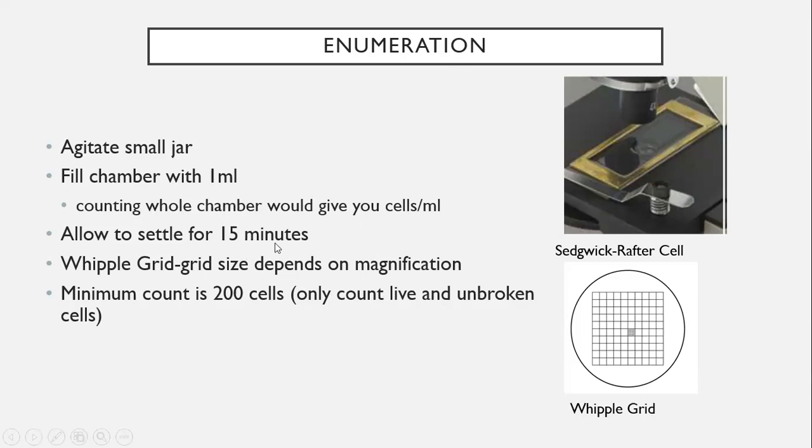But before you start counting, you want to allow the phytoplankton to settle for 15 minutes. And then you have this Whipple grid, which is in the ocular piece of the microscope. So when you're looking down into the microscope, you see this little grid here, which is helpful for keeping track of where you're going as you're counting along the slide here. And again, I'll go over this in the next presentation with some video, so it'll be easier to understand.